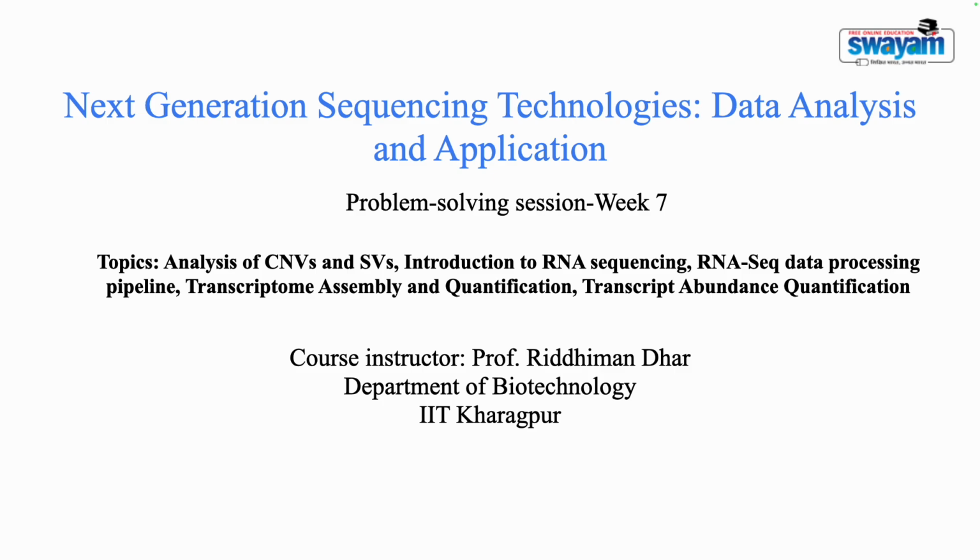Okay, so we'll start with our week 7 problem solving session. The topics we will be covering today are analysis of CNVs and SVs, introduction to RNA sequencing, RNA-seq data processing pipeline, transcriptome assembly and quantification, transcript abundance and quantification.